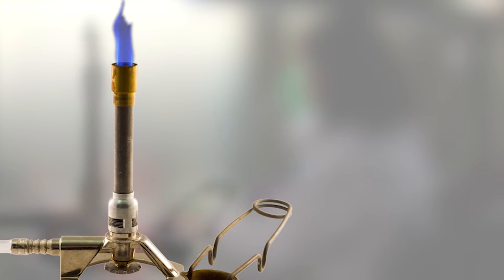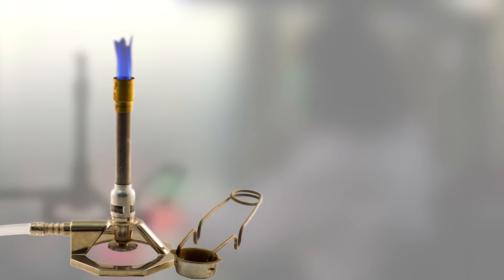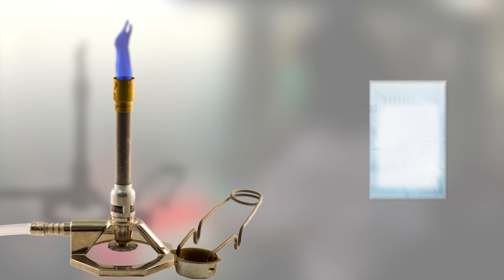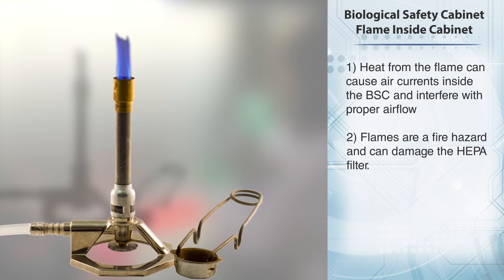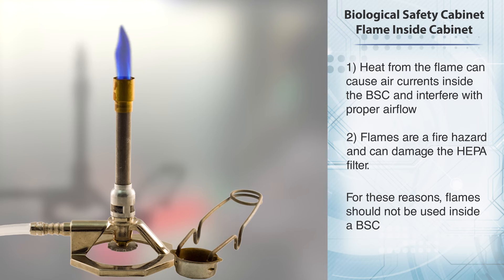Another way to disrupt airflow is by using a flame inside the cabinet. This is not a good idea for two reasons. One, the heat from the flame can cause air currents inside the BSC and interfere with proper airflow. And two, flames are a fire hazard and can damage the HEPA filter. For these reasons, flames should not be used inside a BSC.